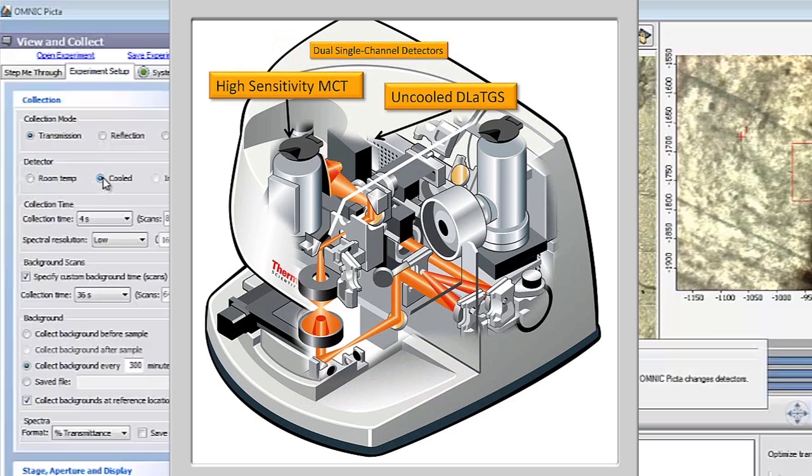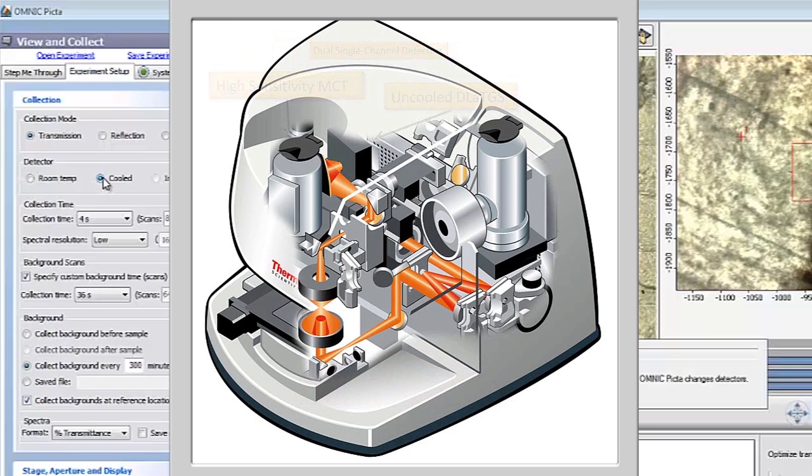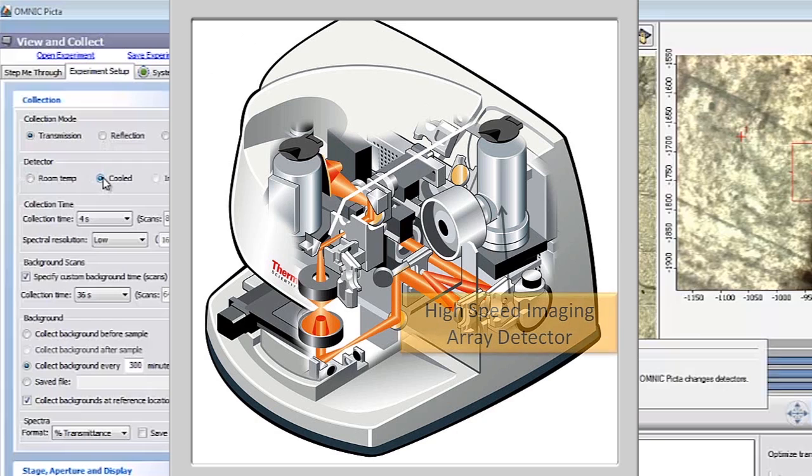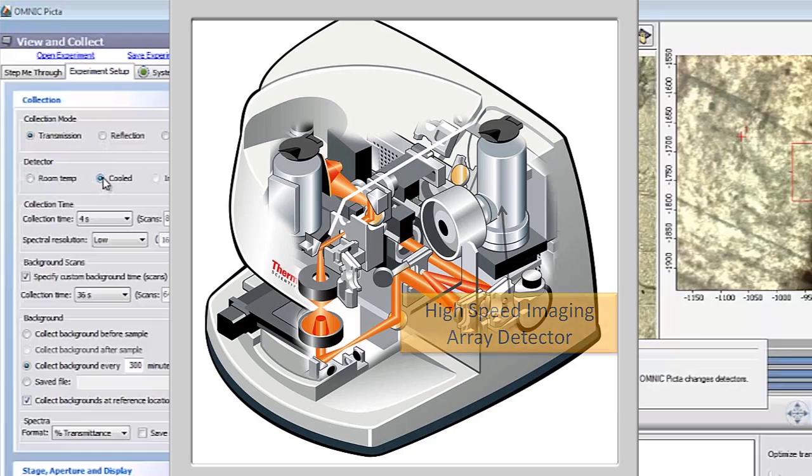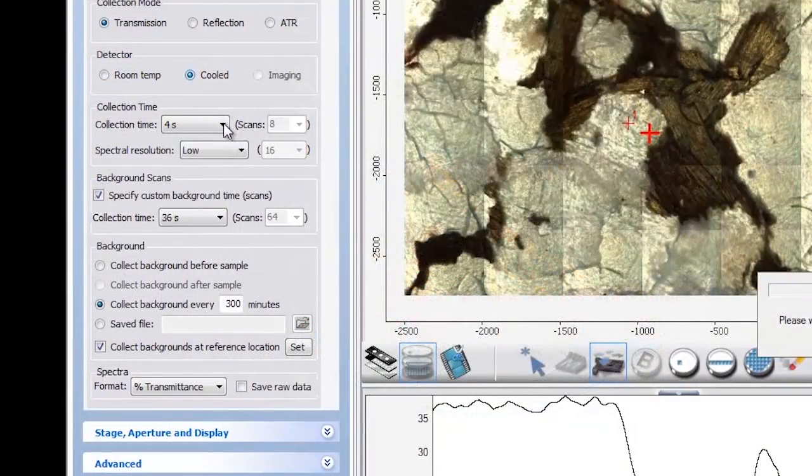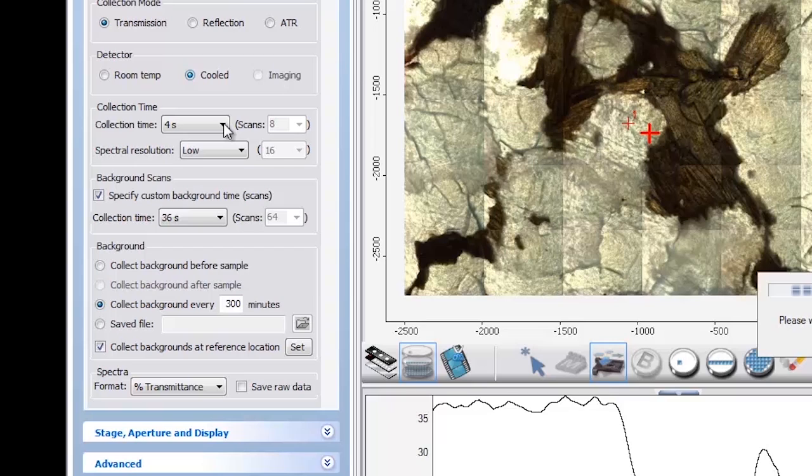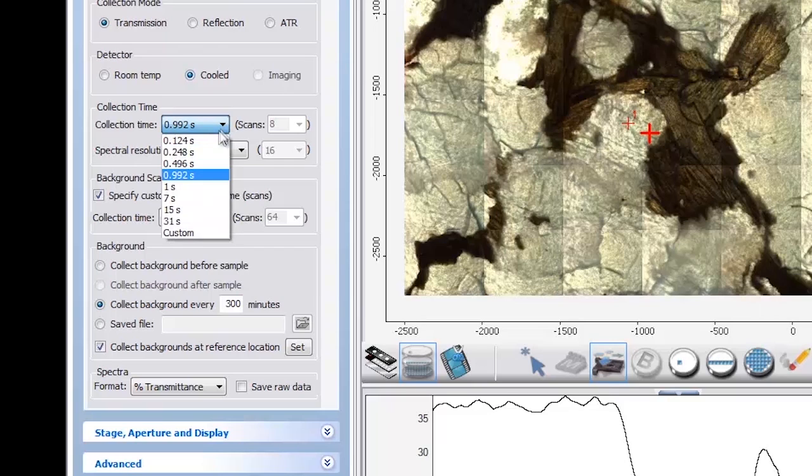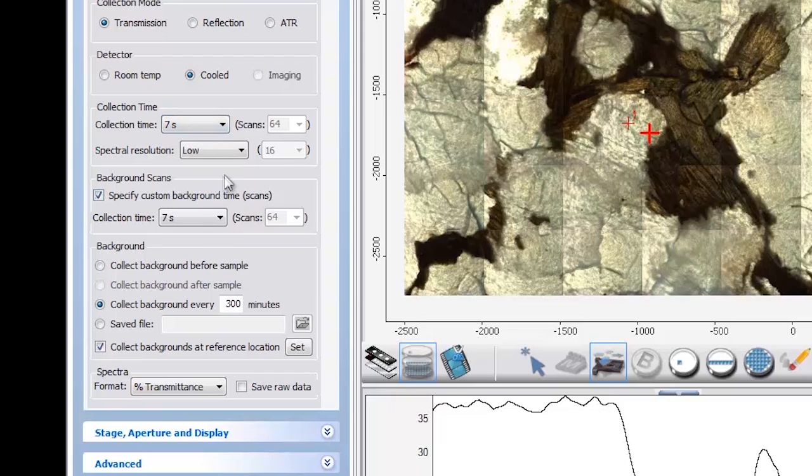In addition, the IN-10-MX supports a linear array detector for advanced ultra-fast imaging applications. Data collection choices are simplified and expressed in plain language, making it easy to transition from other platforms or if you are learning FTIR microscopy for the first time.